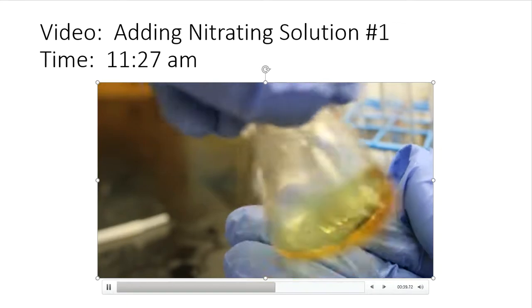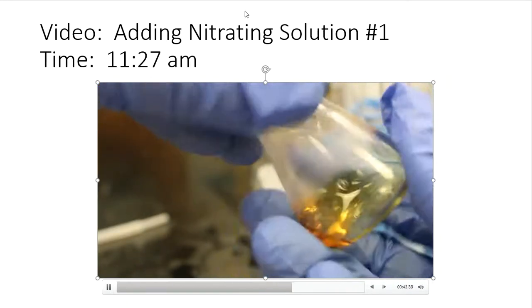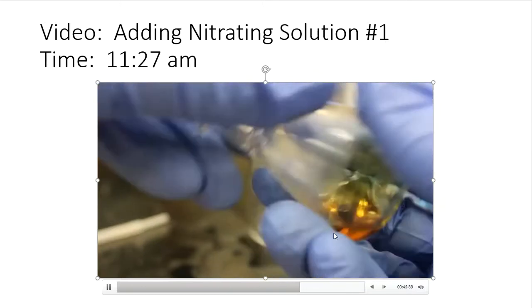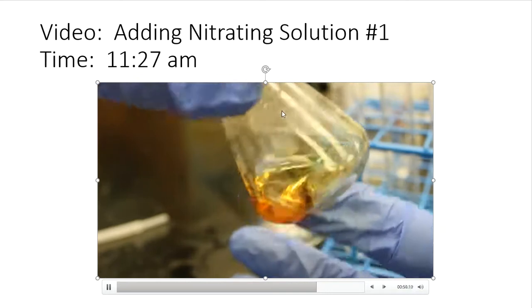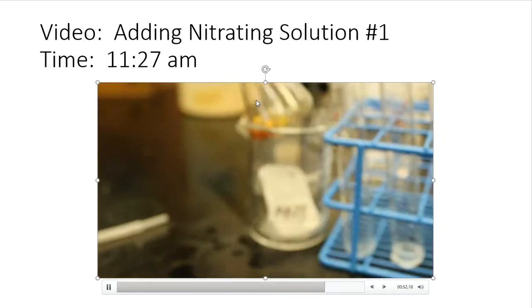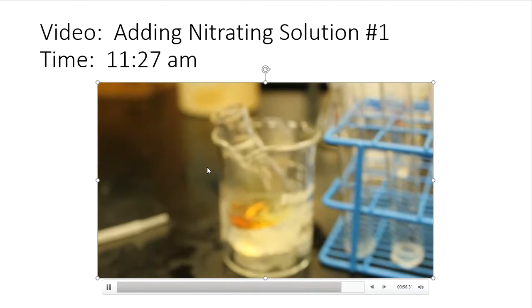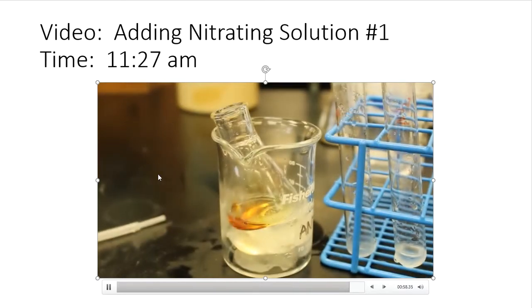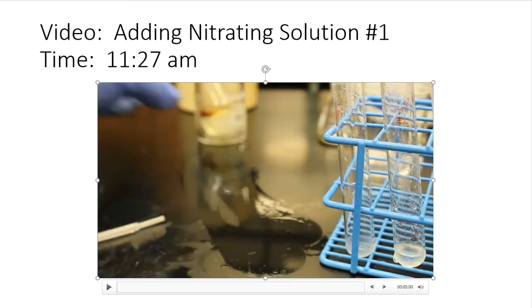And there's your observation for nitrating solution number 1. It keeps going. A beautiful honey amber color. All right, so there's nitrating solution number 1. That happened at 11:27 that morning.